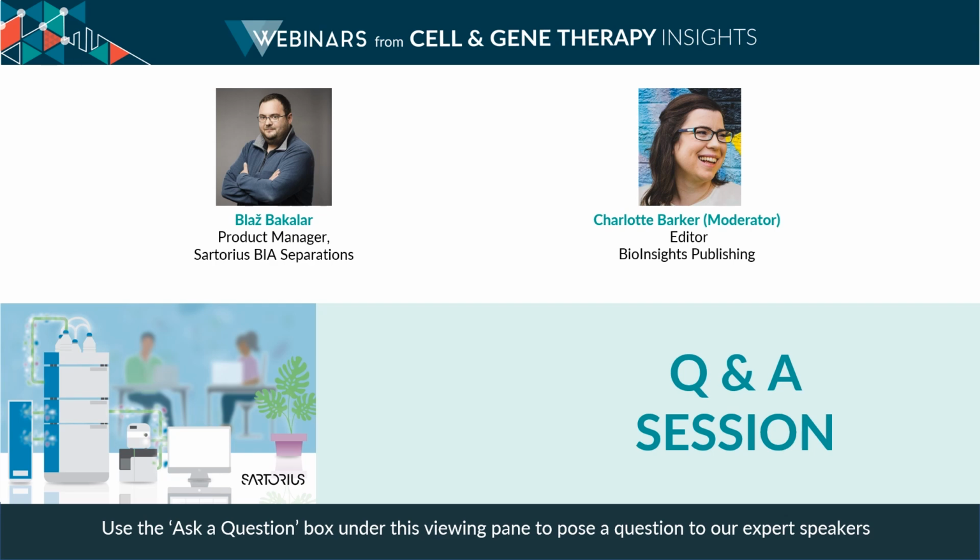And can we also have information on the, I think it's again a similar question, quality attributes of the mRNA like dsRNA, poly-A tail length, etc. Sorry, can you repeat the question? I think it's another similar question asking, could we have more information on the quality attributes of mRNA, like dsRNA and poly-A tail length? Okay, so for dsRNA, I think I already answered quite a few times. But for poly-A, we're still considering if we should go in this direction or not. But if you're interested to strike a collaboration around it, we'd be happy to explore that option.